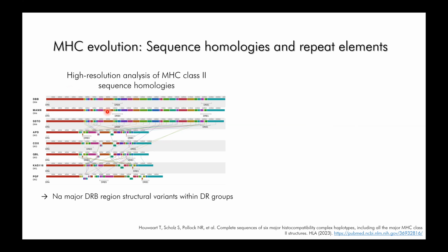But now with these complete sequence resolutions, you can characterize them at high resolution. And in addition to that, we also confirmed that there are no additional previously unknown structural variants in that region, which was also an important finding.